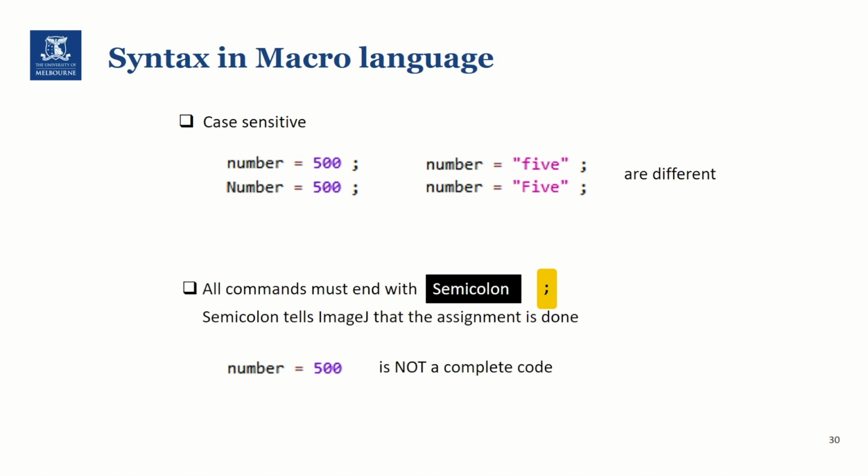These two are the common rules that apply in macro language, and I will cover more syntax that is specific to each element as we go through them.